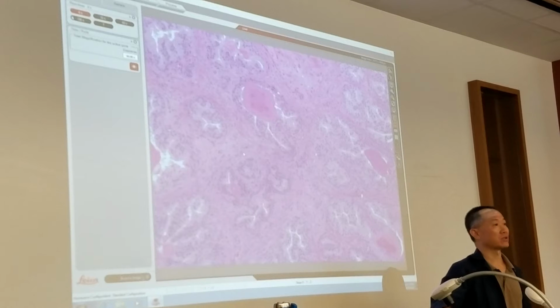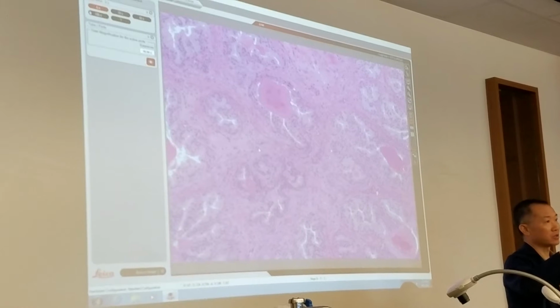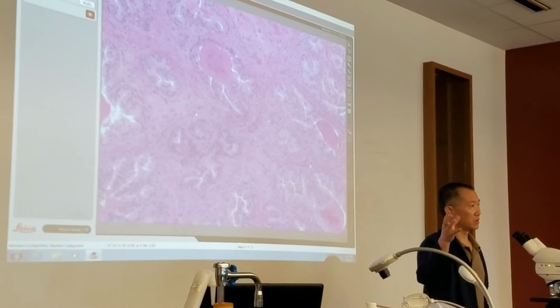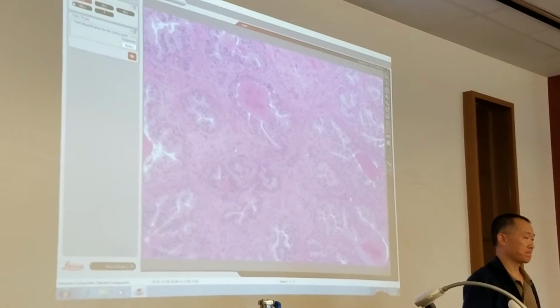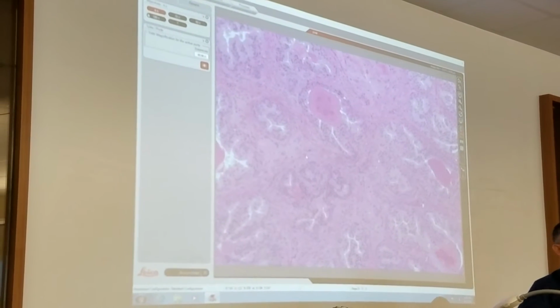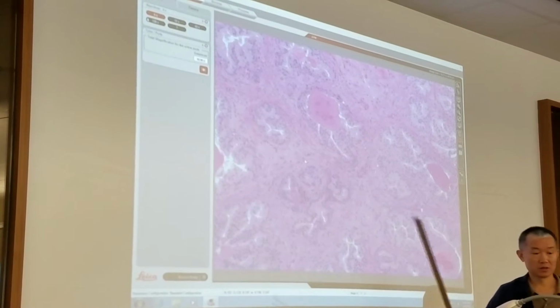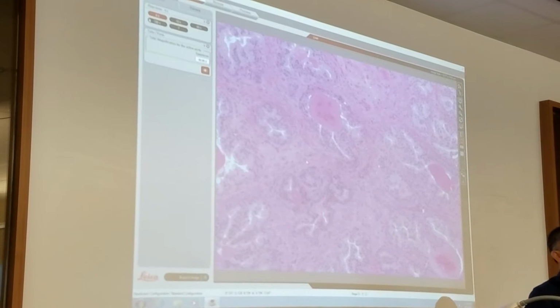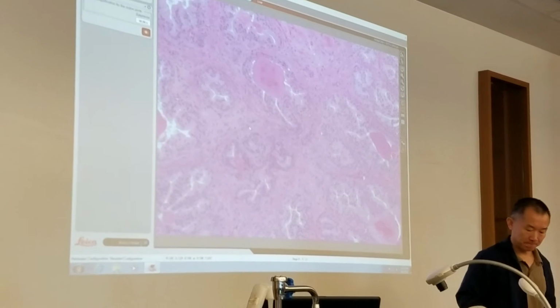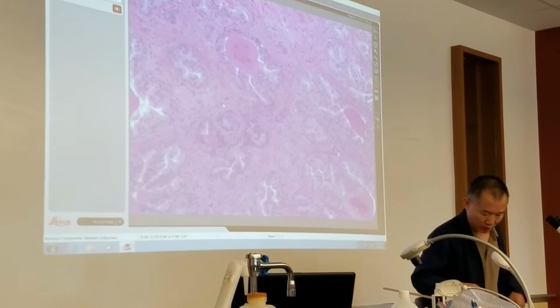So there could be 3 questions to ask you: glandular villi, concretion, and then the organ's name is prostate gland. What was the concretion again? Can you see this pink structure? Mostly it's the calcium crystals. Okay, calcified structure. So that's prostate gland for the development.